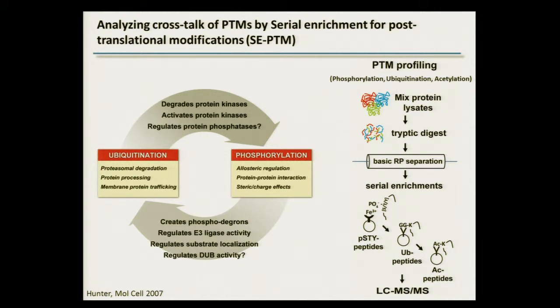For all of those reasons, it's usually interesting to get a holistic picture of the signaling events that happen in your biological model system. And therefore, we have developed new techniques that allow you to analyze protein phosphorylation, ubiquitination, and acetylation from the same biological sample in one workflow.